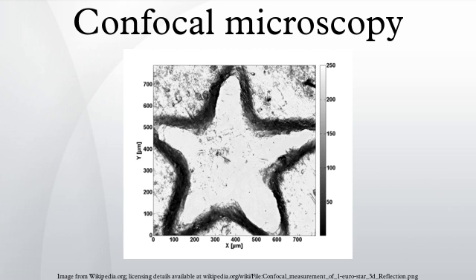Super-resolution: there are confocal variants that achieve resolution below the diffraction limit, such as stimulated emission depletion microscopy. Besides this technique, a broad variety of other super-resolution techniques is available, like PALM, STORM, SIM, and so on. They all have their own advantages, like ease of use, resolution, and the need for special equipment.